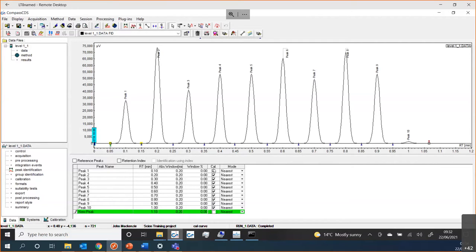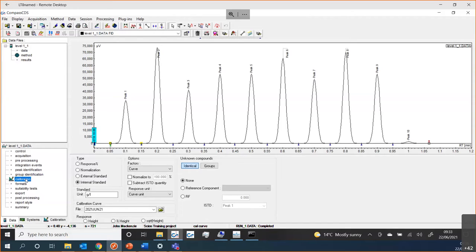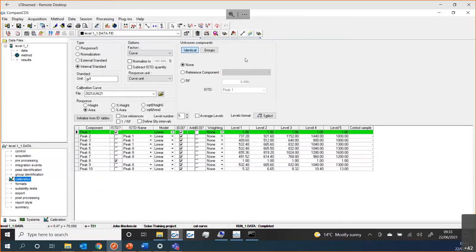When you select them in this calibration column, they will then show up in your calibration screen. You can see I've got quite a lot of data on the screen at the moment. One handy little feature is normally when I'm editing this, I wouldn't need my chromatogram to also be showing. So there's a handy little button here, and if I just press that, my chromatogram is then hidden and I can see my calibration data with no difficulty.